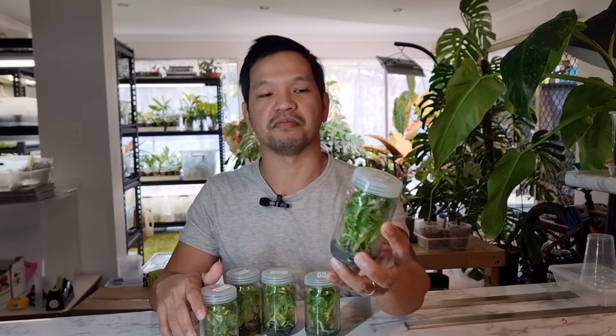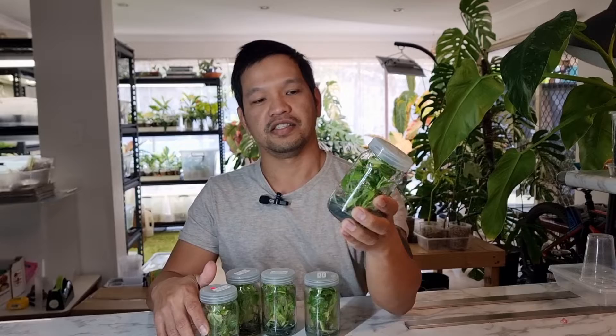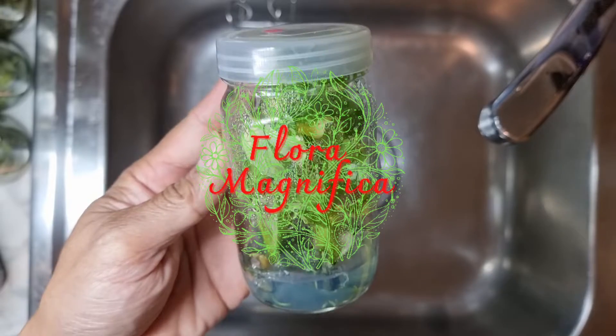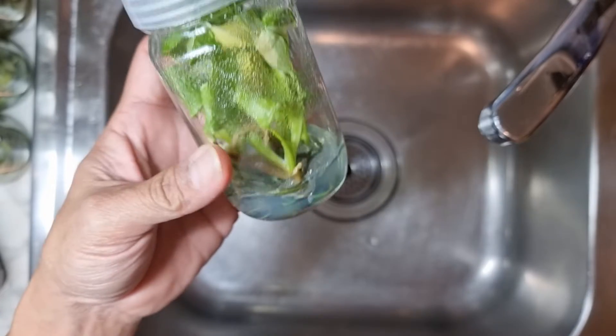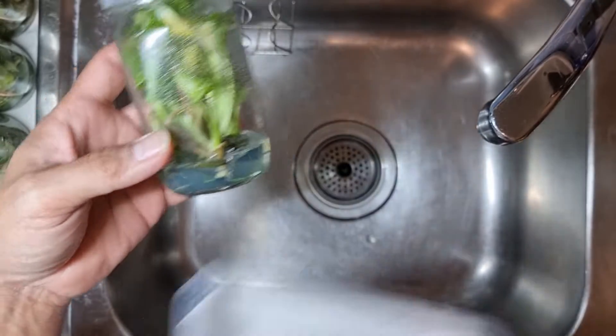Hi, good day, it's Dexter, Flora Magnifica. Today I'm going to be showing you how we deflask, clean, and plant these Monstera Thai Constellation, so join me.